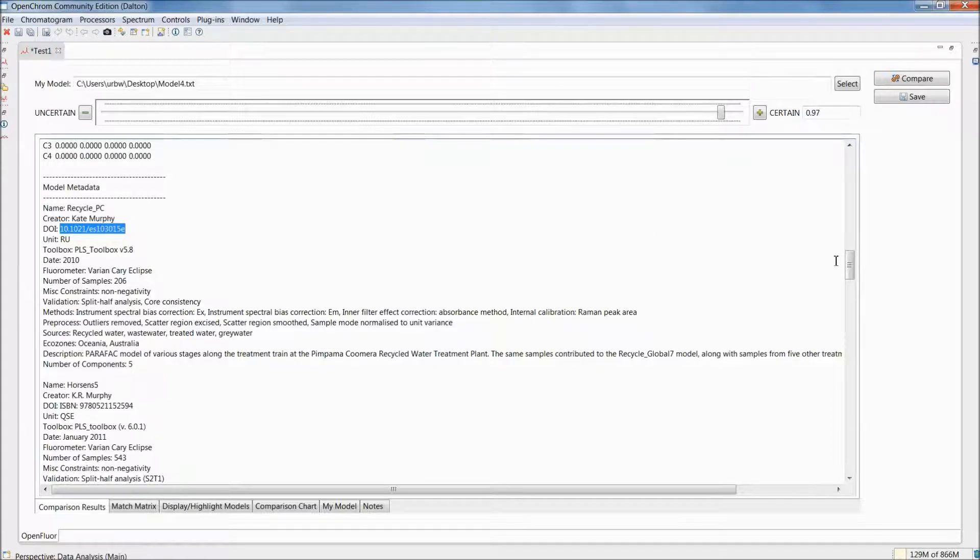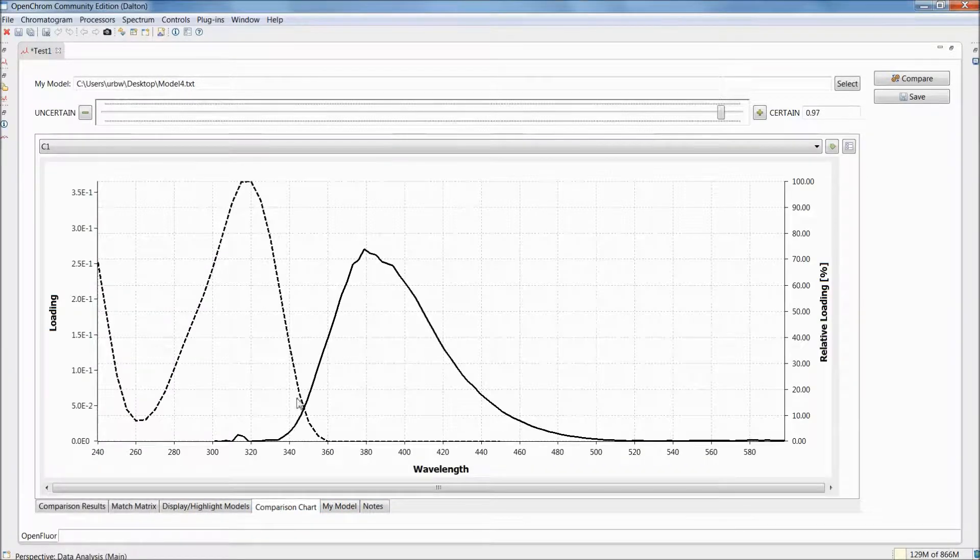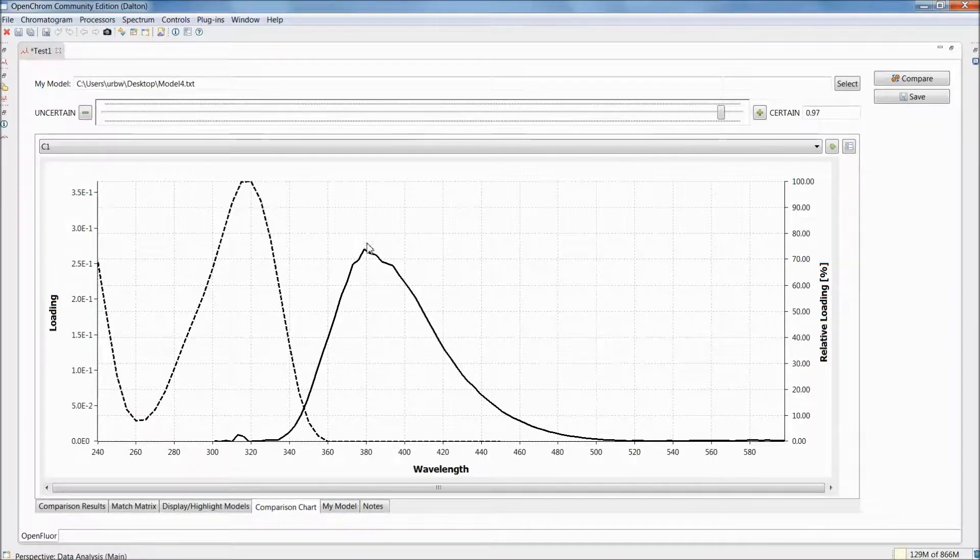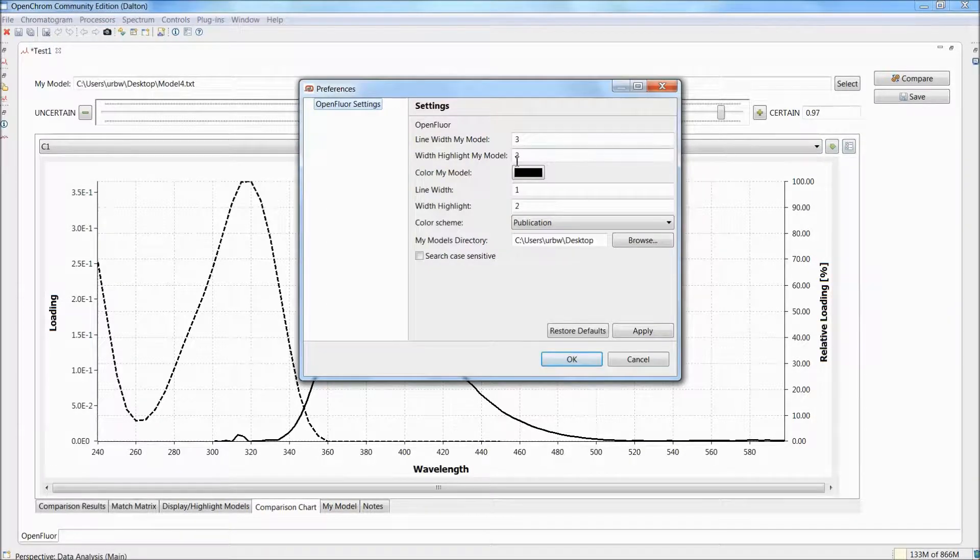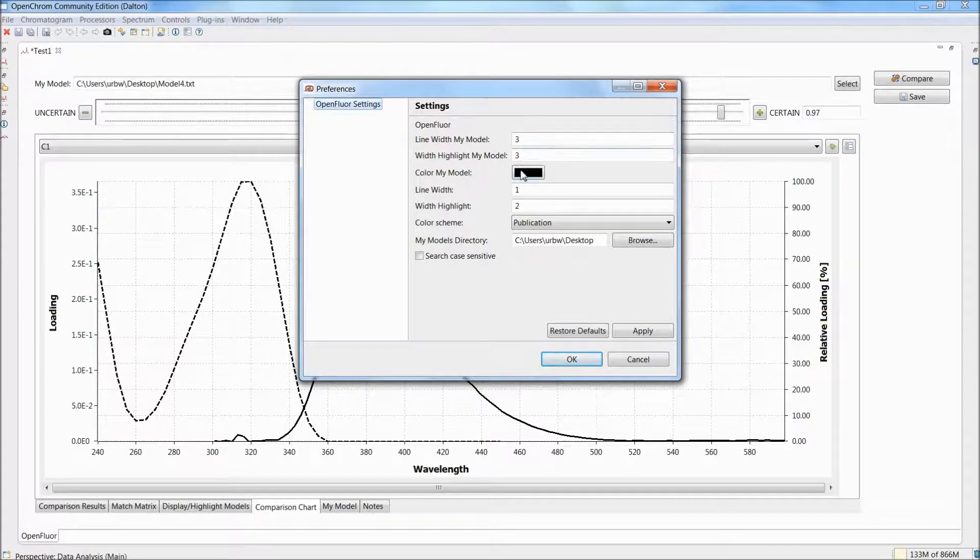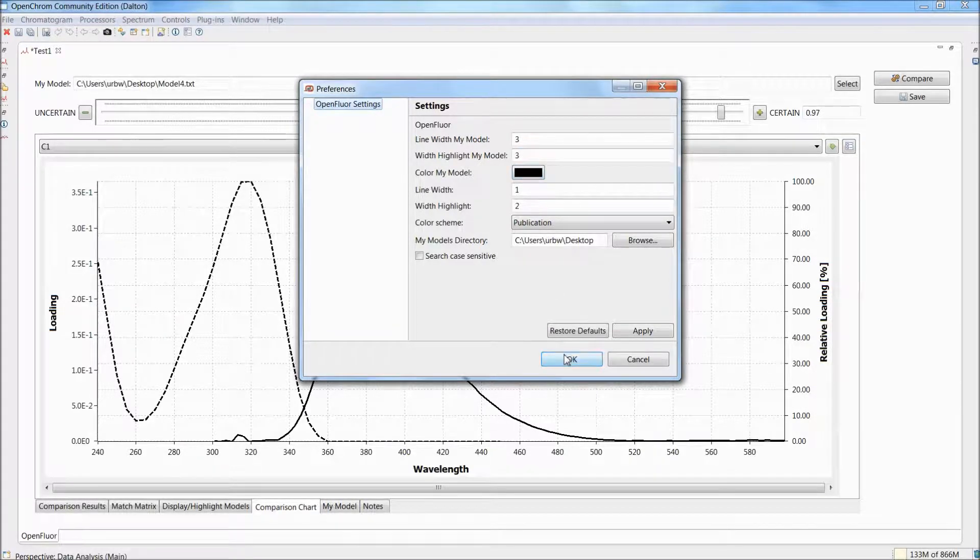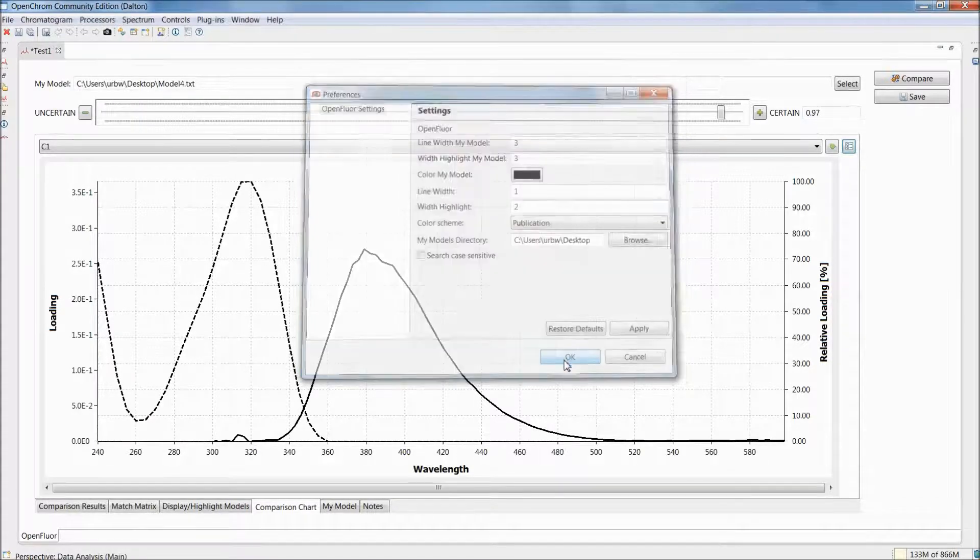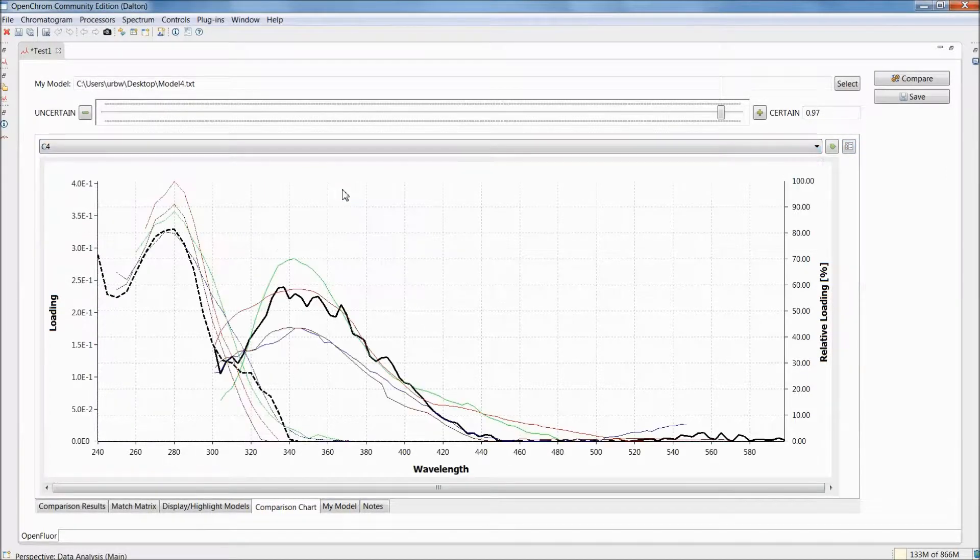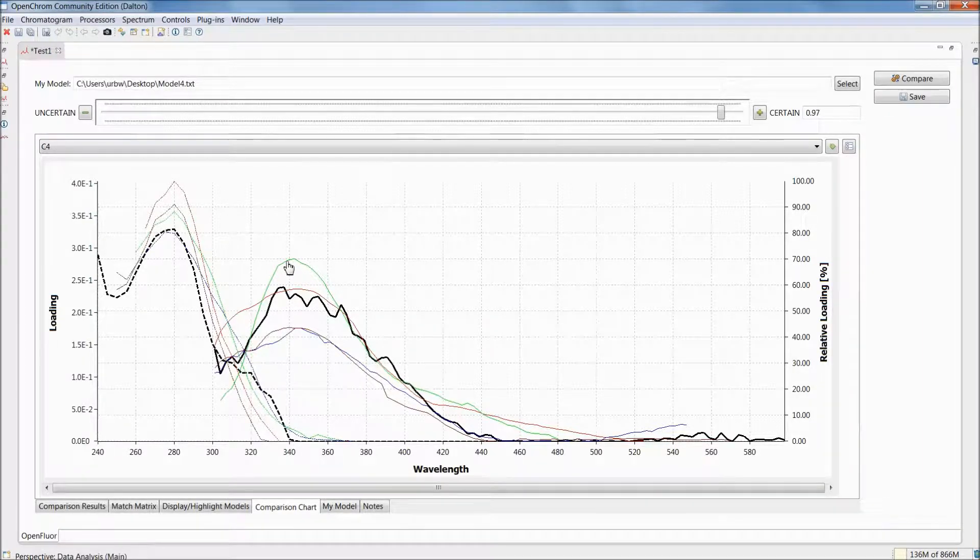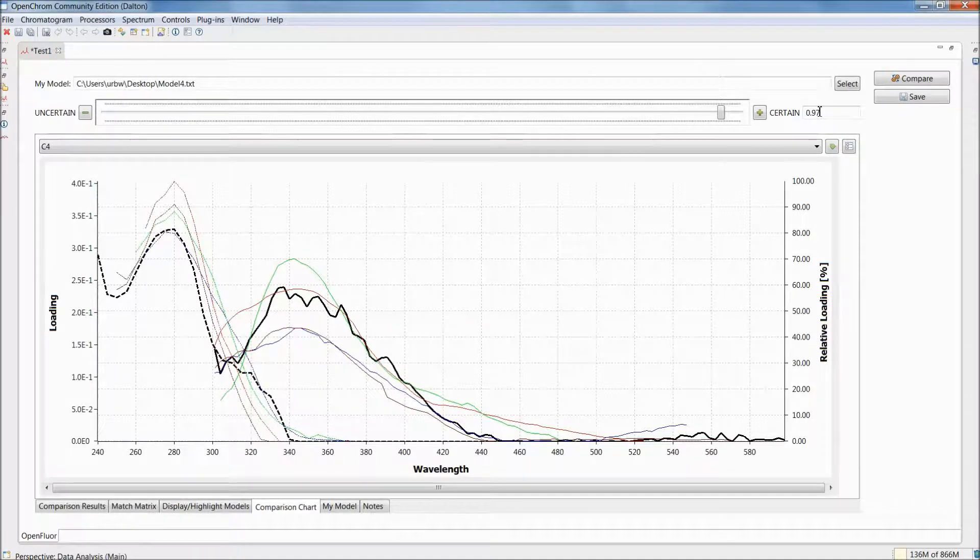The next interesting thing is to actually plot these matches. And that you can do in the tab Comparison Chart. It starts with component 1. You can see your own model components are always going to be black and slightly thicker in line width. But you can change these settings simply by clicking on this tiny little icon here. It's a shortcut to the OpenFloor settings within OpenChrome. You can change the line width of your own model and the color of your own model. But I would suggest leaving it as it is for ease of viewing. But, of course, this is all changeable. If we go to component 4, we see a couple of matches. This is a protein-like component, but it didn't get too many matches in the database, simply due to the fact that I selected a relatively high similarity score of 0.97.